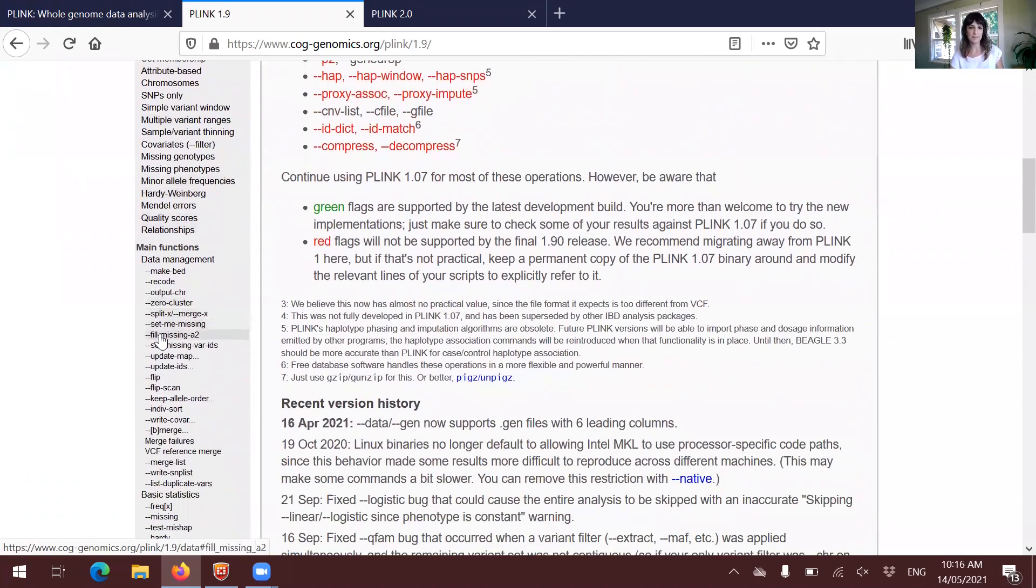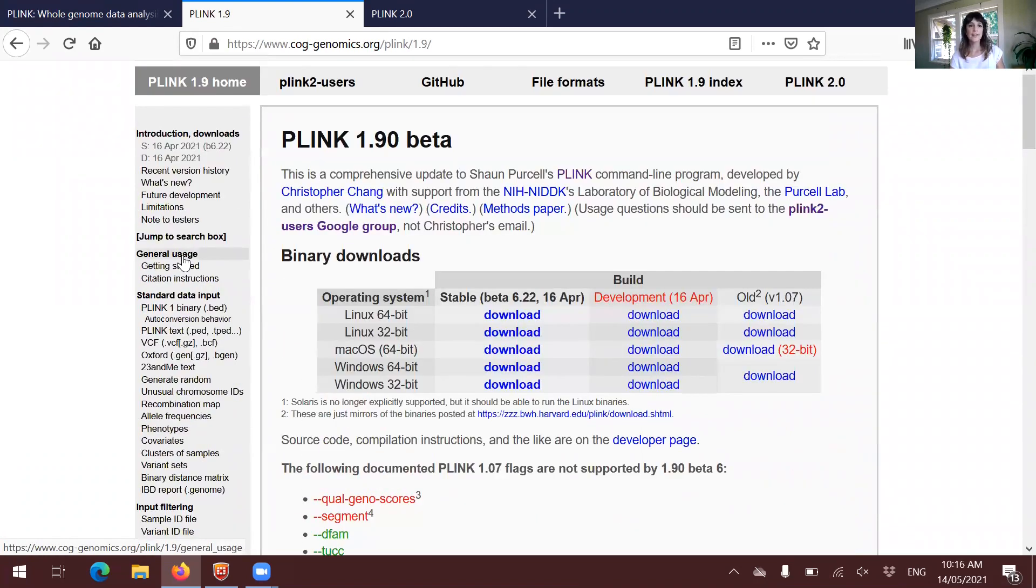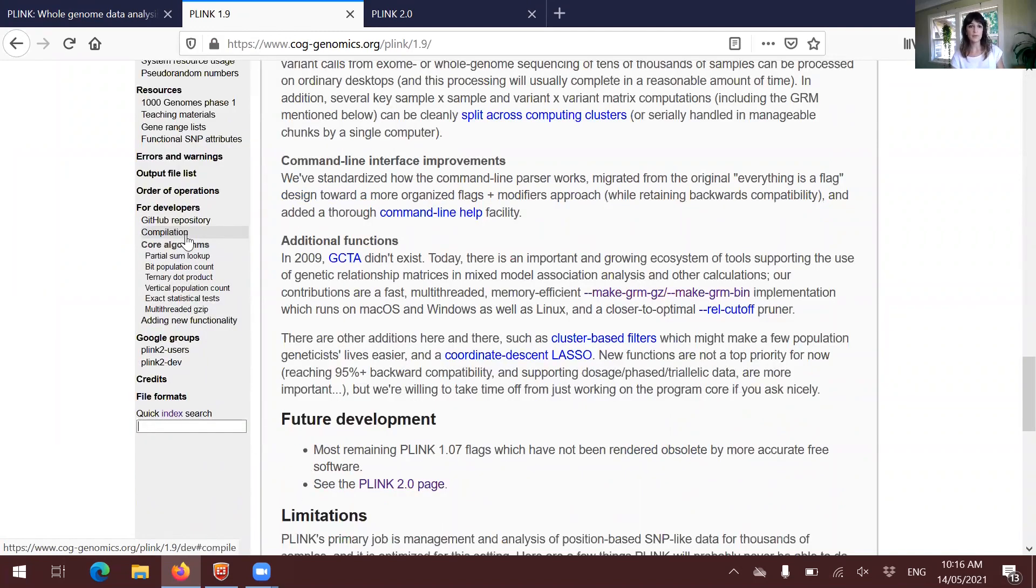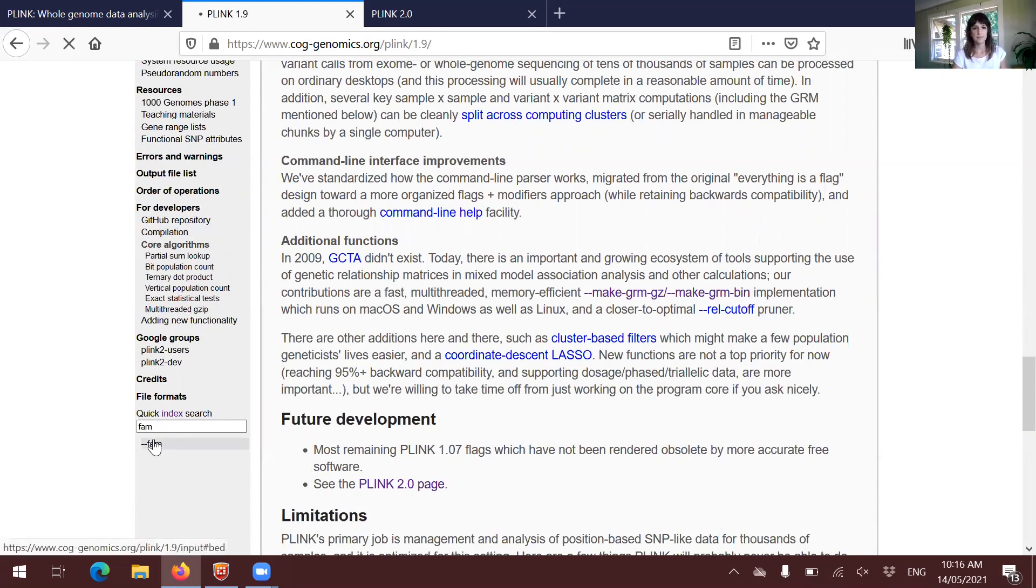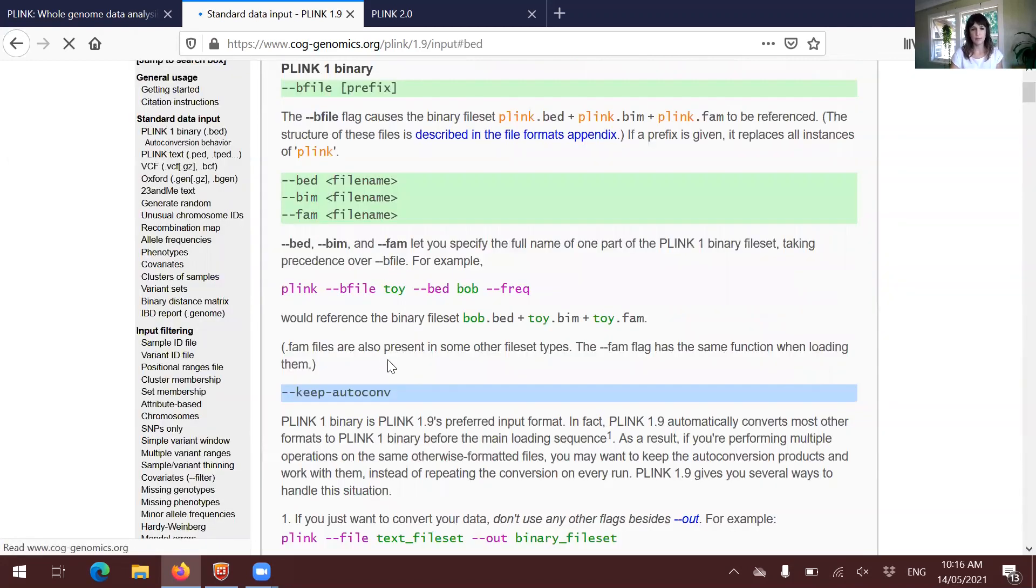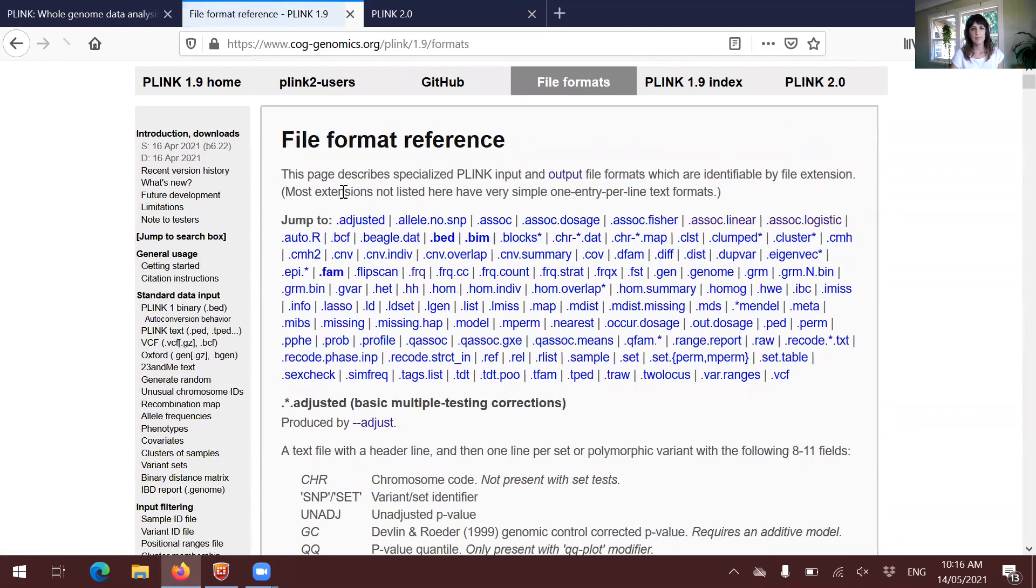One thing that is very nice is that you can just jump to the search box here and just write whatever you need, and then it will take you to the appropriate information. So that's very nice.